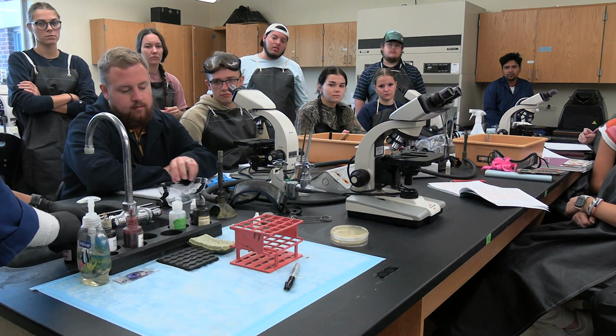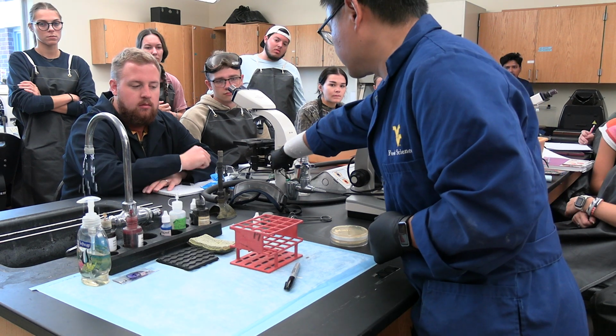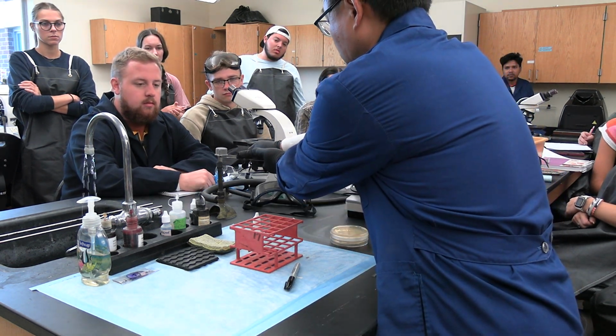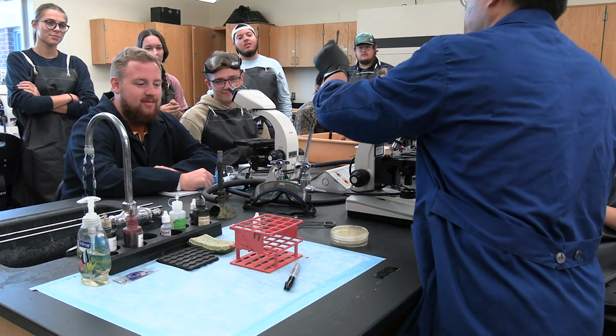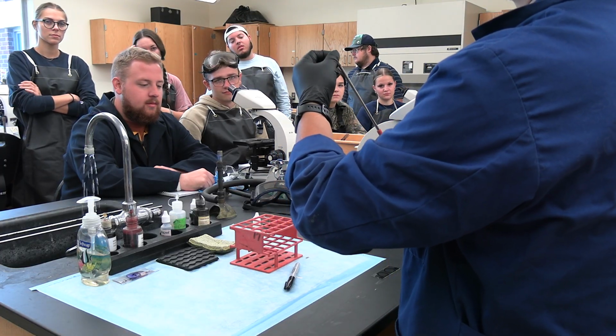We want to make sure the Bunsen burner is working. That works today, very good. So we have a loop, and make sure the loop is straight.